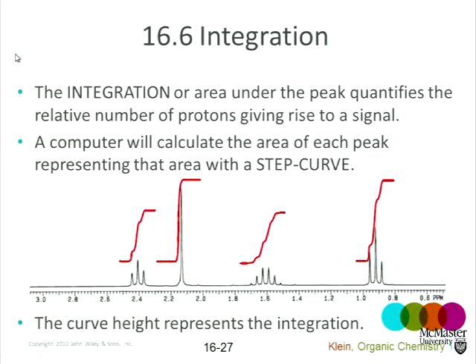Here, we can measure the area under the peak. And these are typical traces that you see. This is integration in the mathematical sense, right? You know, there's no integration at high school, right? Integration is the opposite of differentiation, yes. Differentiation is mathematical stuff where you look at the gradient of things, right?